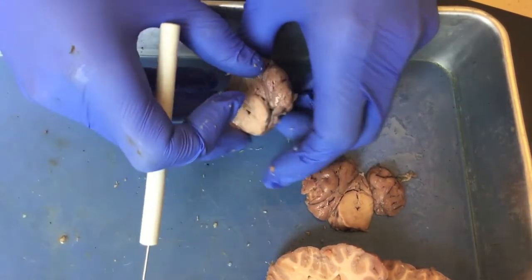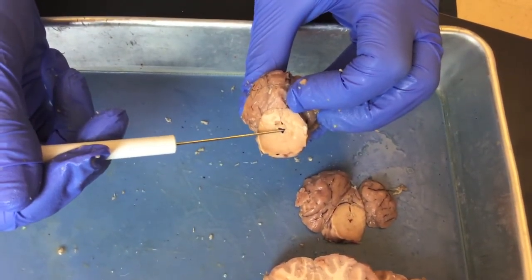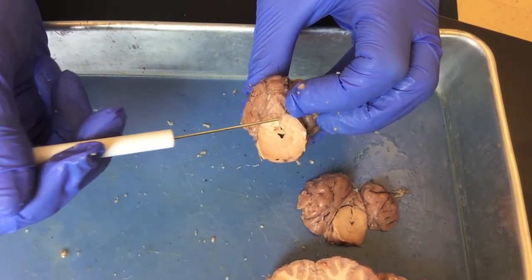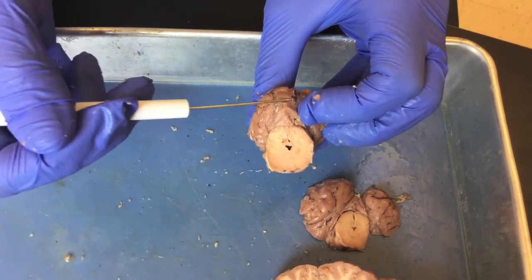Moving further posteriorly, again, you can see we're still in the midbrain here because we have the cerebral aqueduct. So we would find the corpora quadrigemina here, and now we can see that we're approaching the cerebellum.